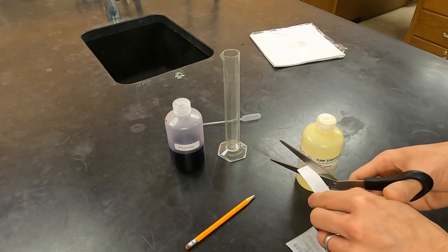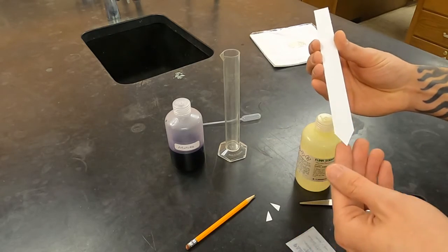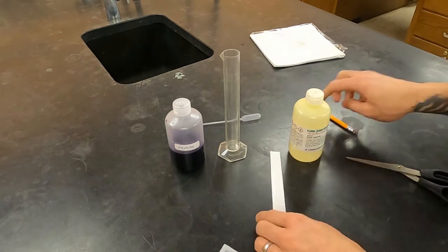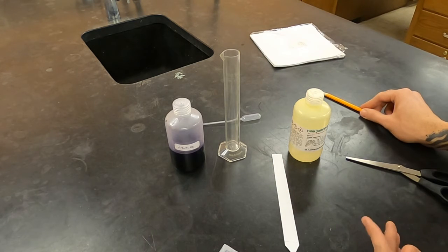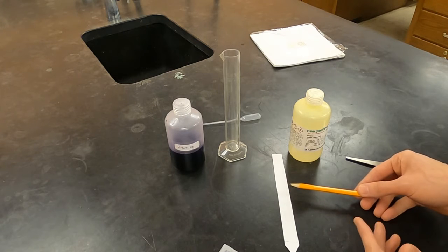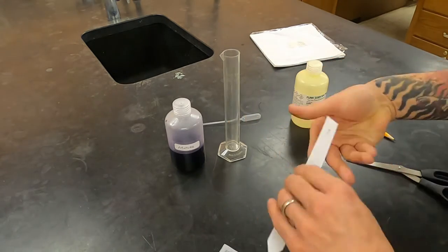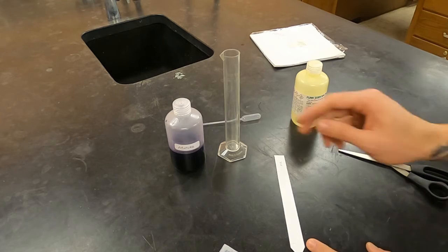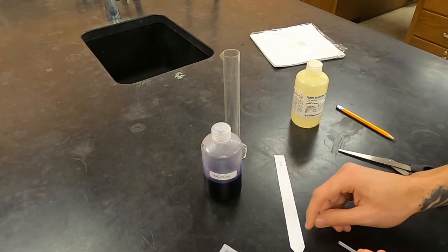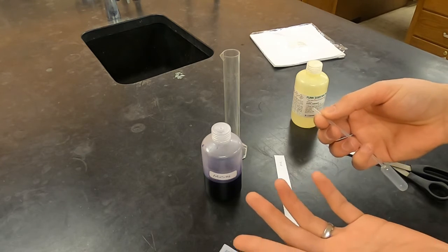First, we're going to cut the end of the paper into a wedge. They don't have to be exactly the same. Then, using a pencil, gently and faintly mark the origin. If you're going to be doing this with many different solvents, it's important that you remember which paper was in which solvent, so I'm going to write at the top that I'm using ethyl acetate. The next step is to spot your sample onto the origin. These pipettes are going to leave drops that are too big, so I'm going to show you how to change a regular transfer pipette into a micro pipette that will give small drops.